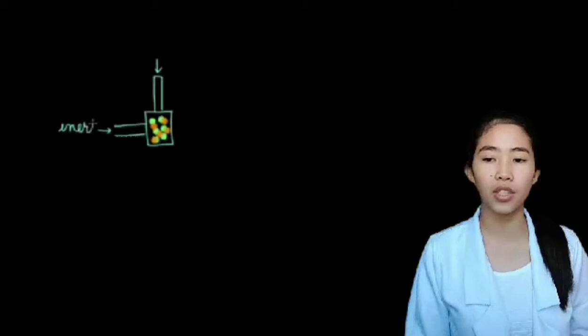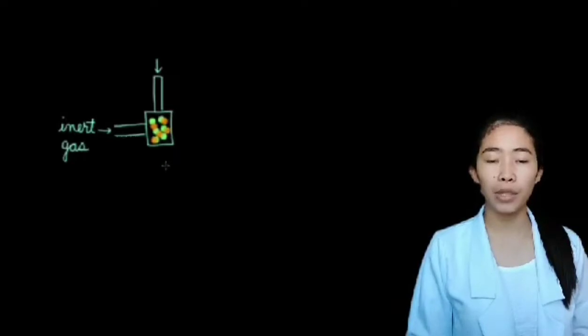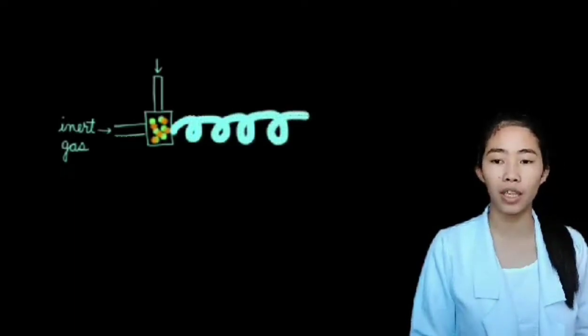The vaporized sample that is injected is then carried by the inert gas, which is often helium or nitrogen. The inert gas goes through a glass column packed with silica that is coated with a liquid. Materials that are less soluble in the liquid will elute faster than the material with greater solubility. In gas-liquid chromatography, the liquid stationary phase is adsorbed onto a solid inert packing or immobilized on the capillary tubing walls. The column is considered packed if the glass or metal column tubing is packed with small spherical inert support.